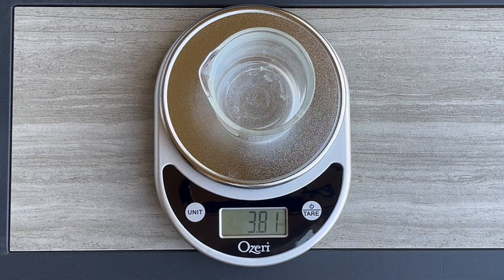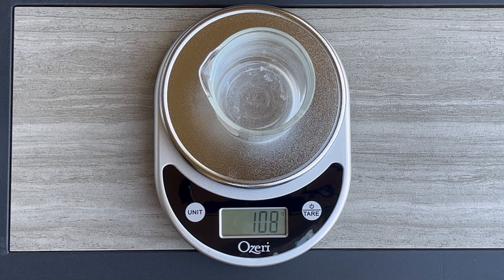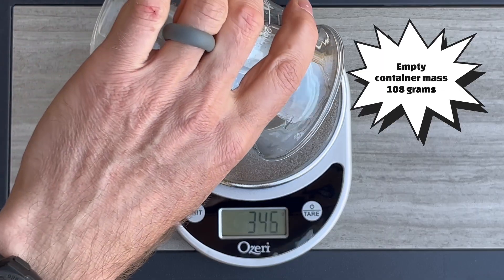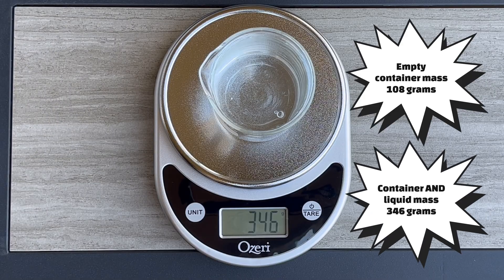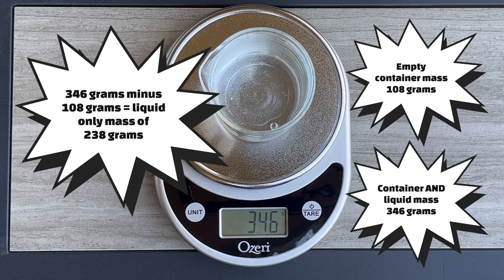For example, if I'm finding the mass in grams: the container reads 108 grams, and the total with liquid reads 346 grams. Just subtract the mass of the container and you have the mass of the liquid only.